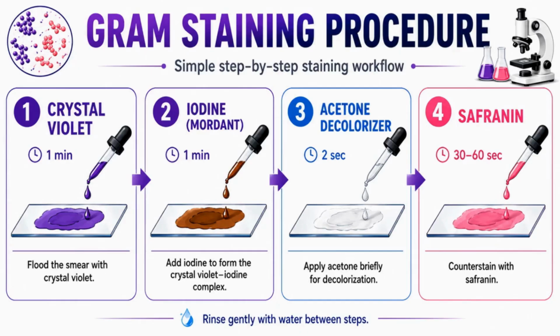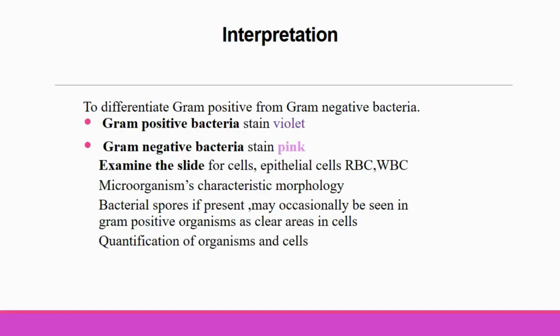Alternatively, we can use neutral red also as a counter stain, especially for gonococci. So the slide is rinsed with tap water and dried and then examined under the oil objective microscope. So next comes the interpretation. So the smear is observed in the oil immersion objective.